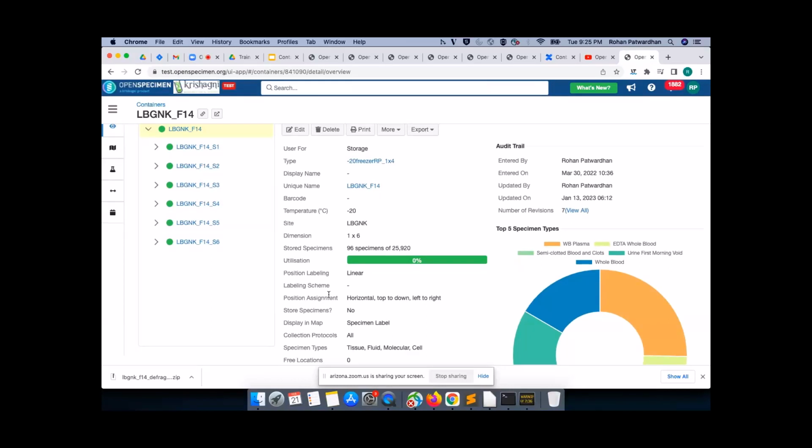So I'm assuming that with the defragmentation, let's say if I had samples 1, 2, 3, 4, and 2 and 3 were taken out, it would simply be compressing. So then you would have 1 and 4 as the suggested defragmentation result. Yeah.